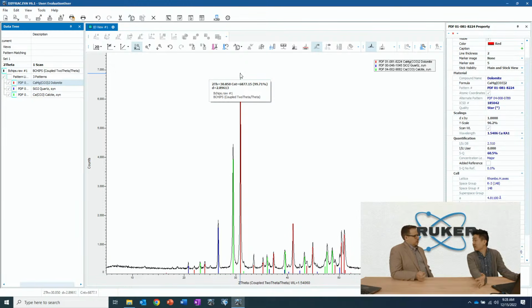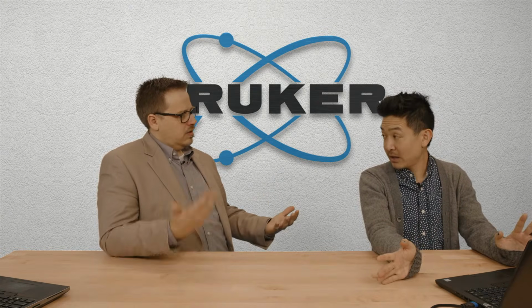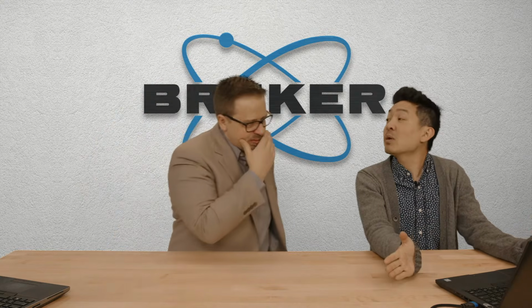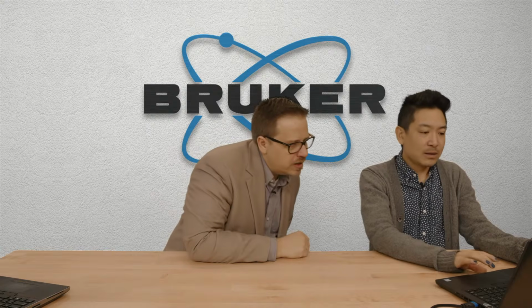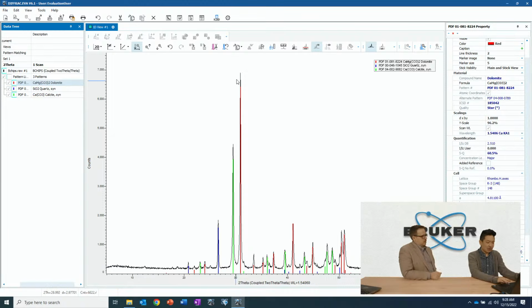So aluminum oxide. So if you were to mix a 50-50 mixture of corundum and dolomite, and this other phase, the I over IC tells you the scaling factor of the other phase. Right, exactly. Okay. So in this case, it gives you a frame of reference. Yeah. Right. Okay, so dolomite is 2.5. So for dolomite, it's 2.5, which means that this big peak here at 31 degrees compared to the biggest peak of corundum, which is at 35, is 2.5 times bigger in a 50-50 mixture.